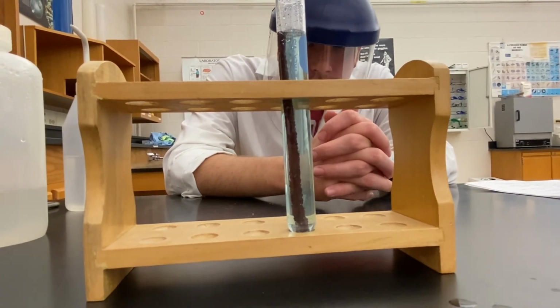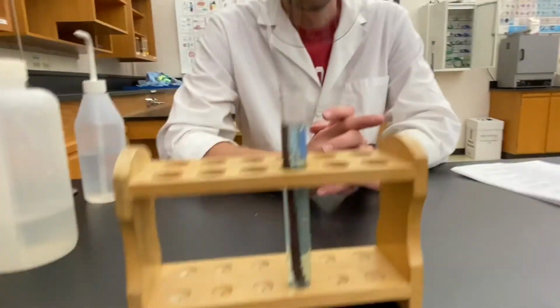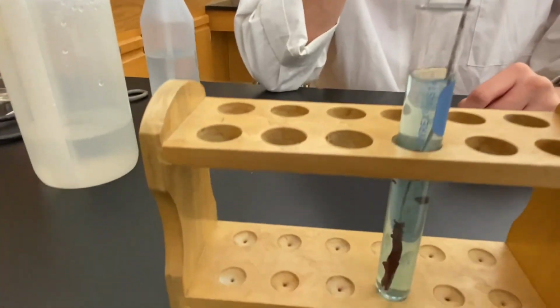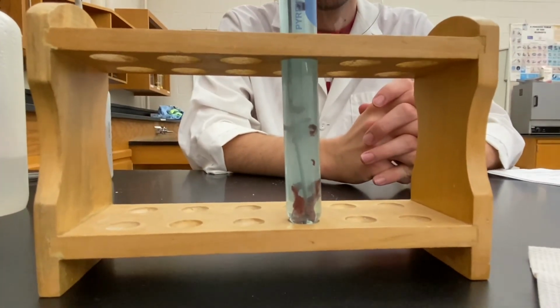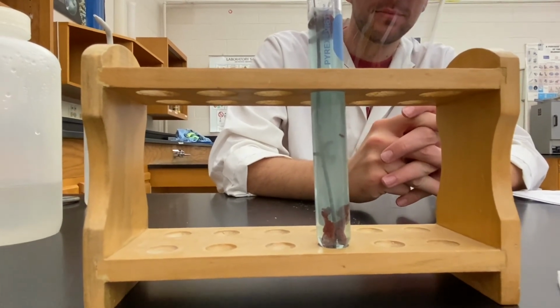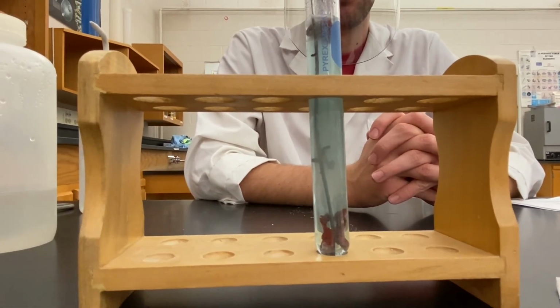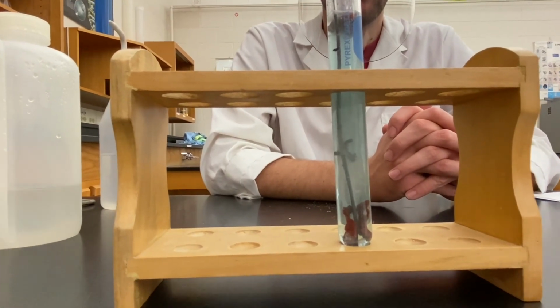So you can note that the color has faded pretty substantially, and then if we take the wire out, the wire, that's all copper, and if you notice, it has a slight red color. So the blue copper ions that were in the solution have gained electrons, and they've turned into copper atoms, and now they are just pure copper. So a lot of chemistry in one test tube.